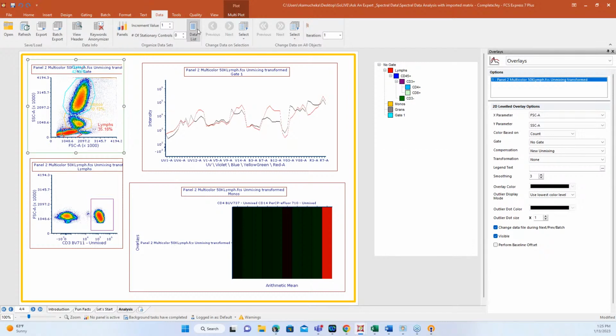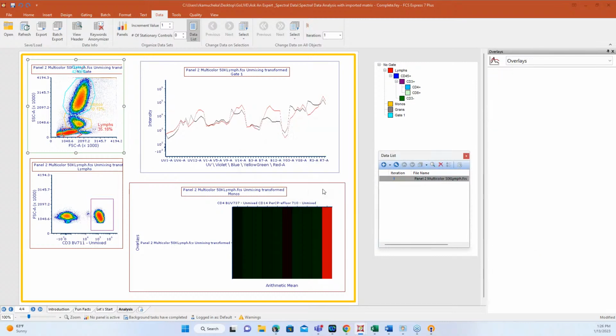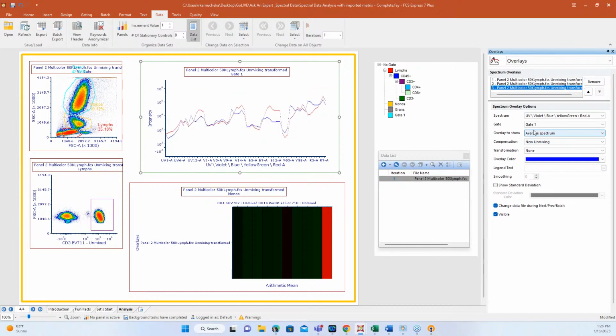It's all designed so that you don't have to etch a sketch into the world and restart over. You can just go back a couple steps and figure out what's going on. As I've been demonstrating today, sometimes things just go a little left of center, so don't worry about it. That's part of the analysis. What we've tried to do with FCS Express is to be able to adjust and figure out, if my gates aren't working, what tools can I use to keep it moving? Having the ability to just replace the gates, because then I know, one for one, I don't have to rebuild this hierarchy. They're going to go into the right place. I just redraw the gates and keep moving.